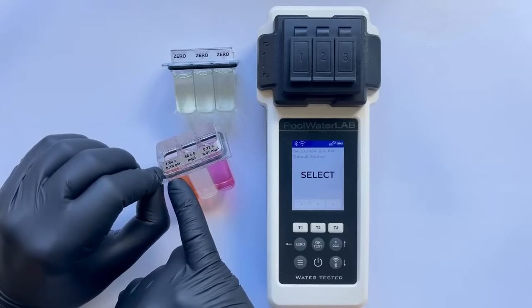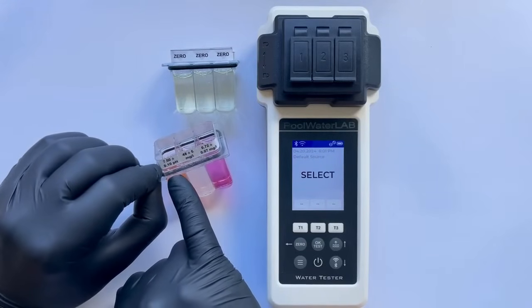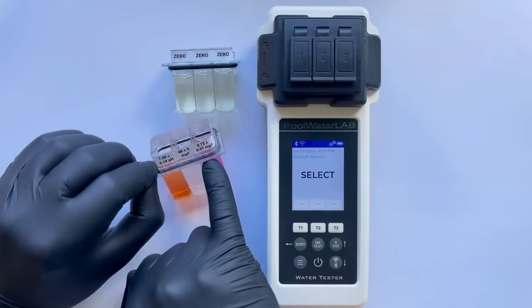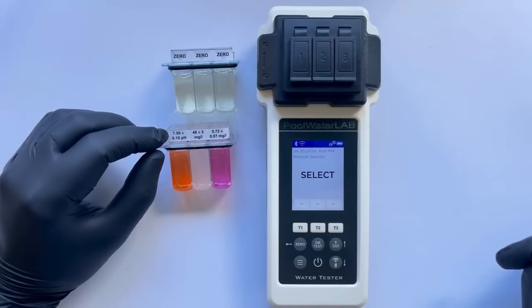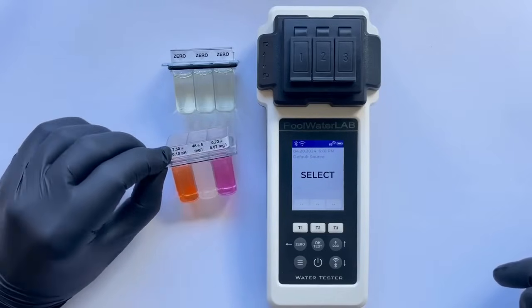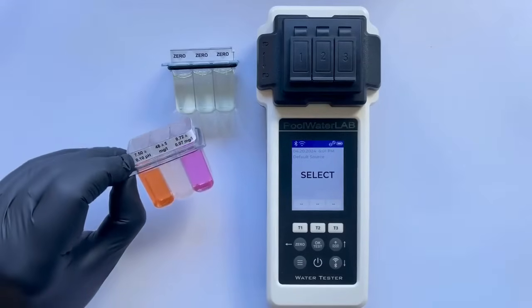In the laboratory, these indicators, pH, CYA, and free chlorine levels, have already been pre-tested, and the results are visible on the cuvette for clear and easy verification. This ensures that their baseline values are accurately established before we use them for further comparative testing.